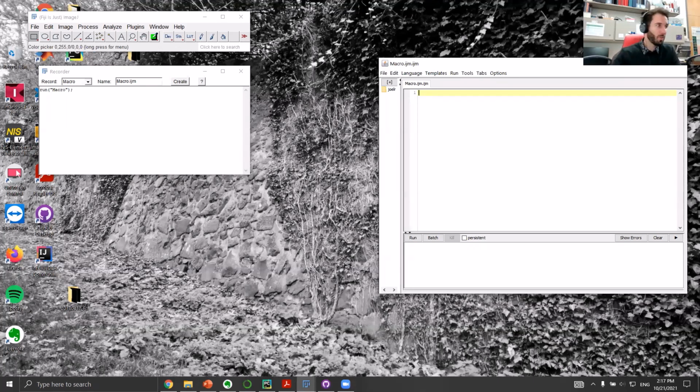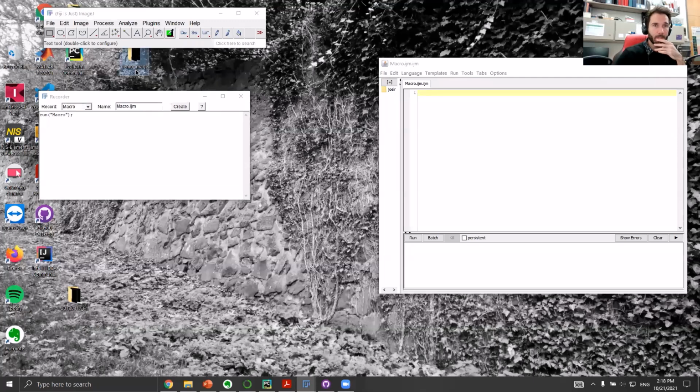We'll start with exercise 1. The goal of exercise 1 is to make a composite image, and what I mean by that is a composite image that is openable in regular consumer software. So I have this folder of demo images, downloaded from the GitHub. If we open it, we have 15 images acquired on the microscope.